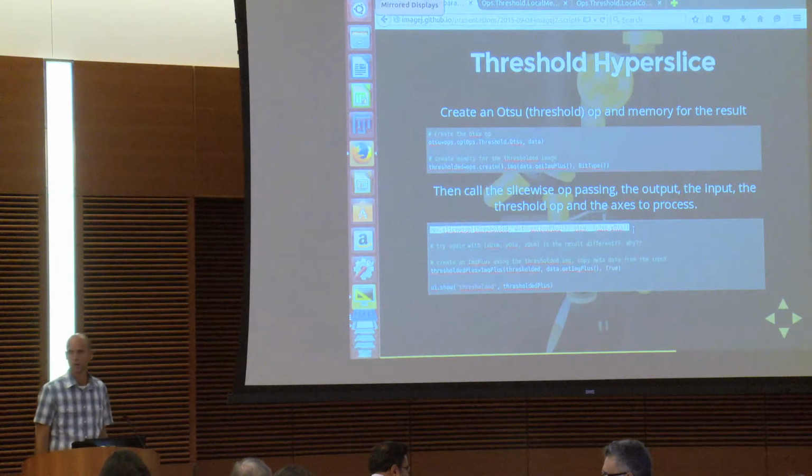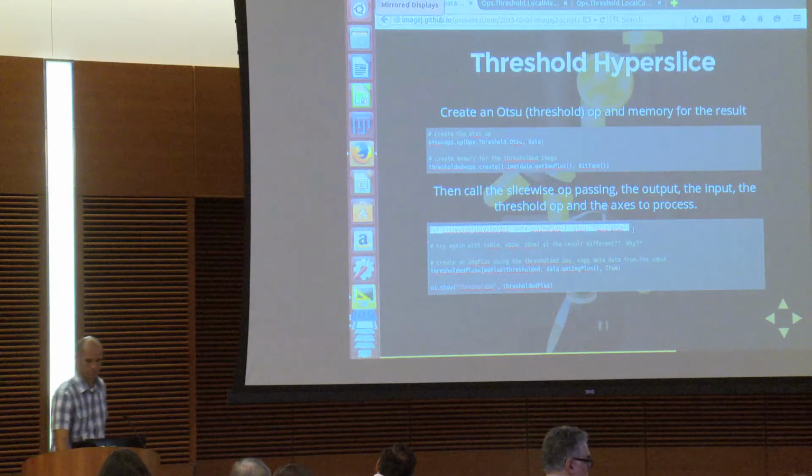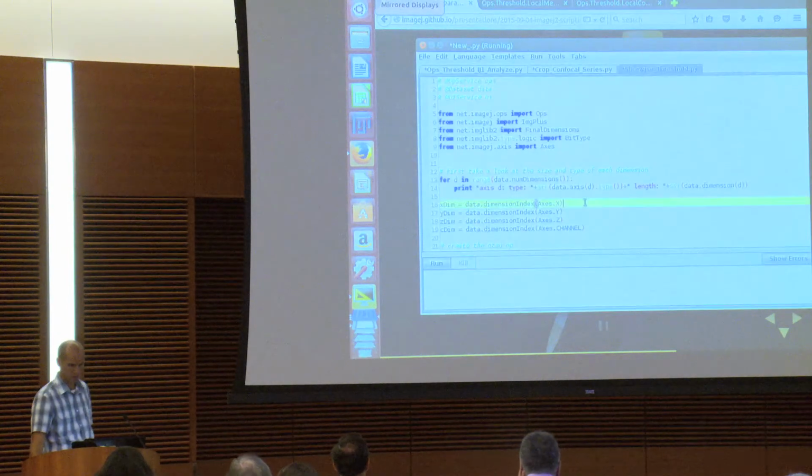That is exactly what Brian is showing. That op is called Slicewise, and it is right there. That's why he's bringing this up now, because it lets you define the subregions. And that's what I'm using in the highlighted code, because we zoomed in here.